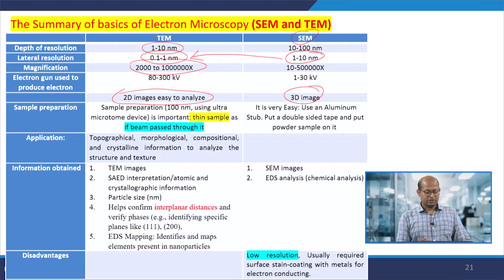In the case of TEM, thin sample preparation is required so that the beam passes through the sample, otherwise we cannot get a good image.